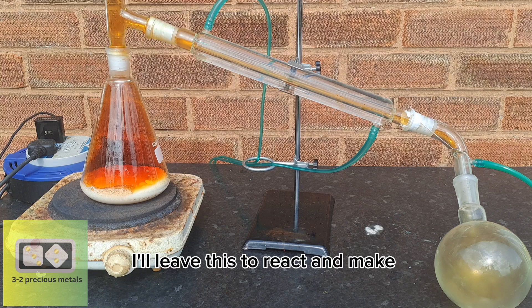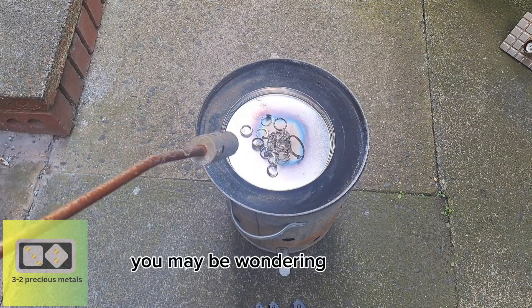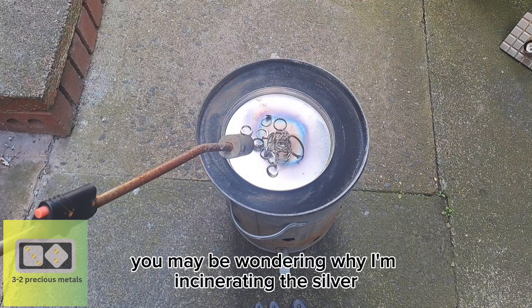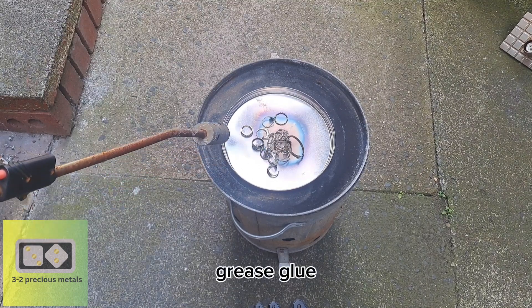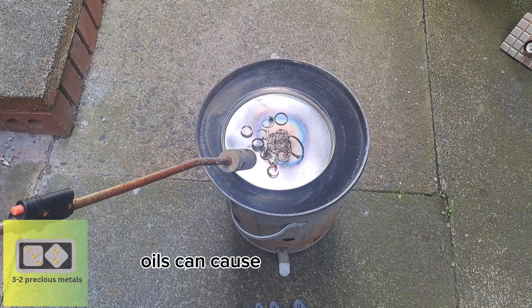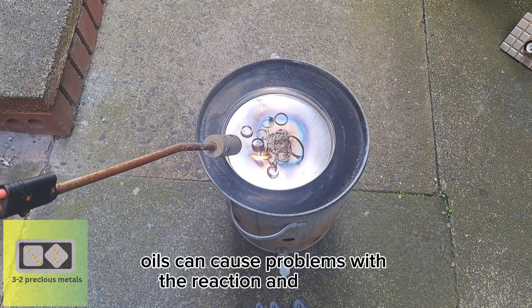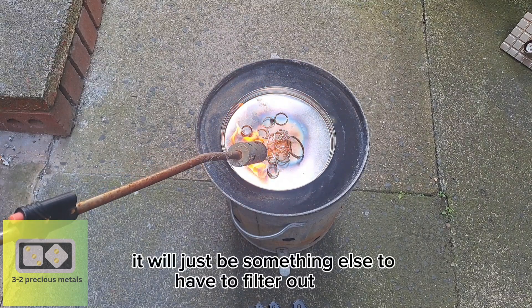I'll leave this to react and make a start on incinerating the silver. You may be wondering why I'm incinerating it — the reason is to rid the silver of any oils, grease, glue, or epoxy resin that might be on the jewelry. Oils can cause problems with the reaction, and the glue and epoxy will not dissolve — they'll just be something else to filter out later.